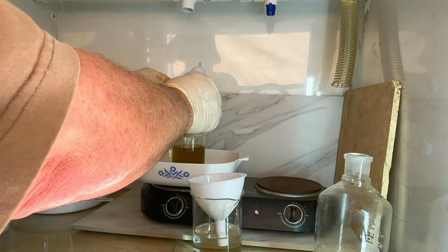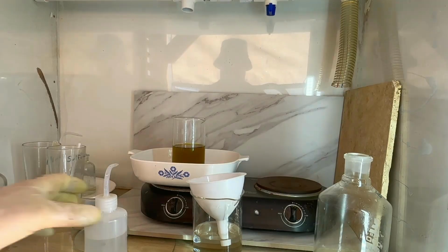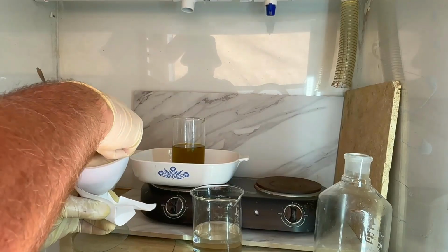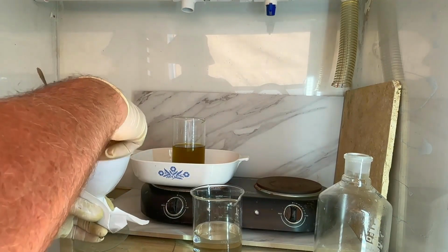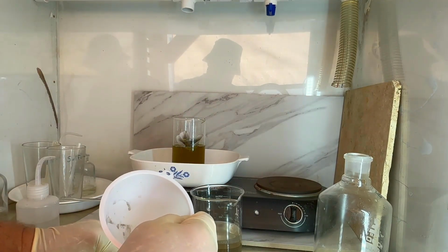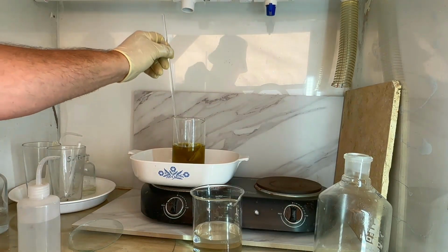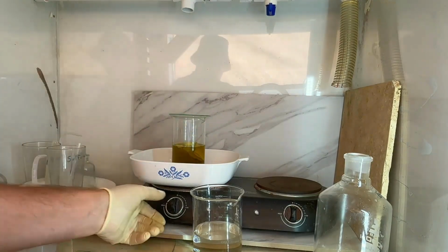Right. So we've finished our filtering. Take the top off here. I'm just going to grab this filter and dump it right in the Aqua Regia. So you can see there's a nice little coating in there. The Aqua Regia will dissolve the filter, so we'll just go and put this in here. You probably saw when I tipped the beaker there, a little bit came out, so I'm just going to wipe down the inside of this, grab that dust and toss it in there as well. And ready to let that go and finish cooking, get all that gold into solution.